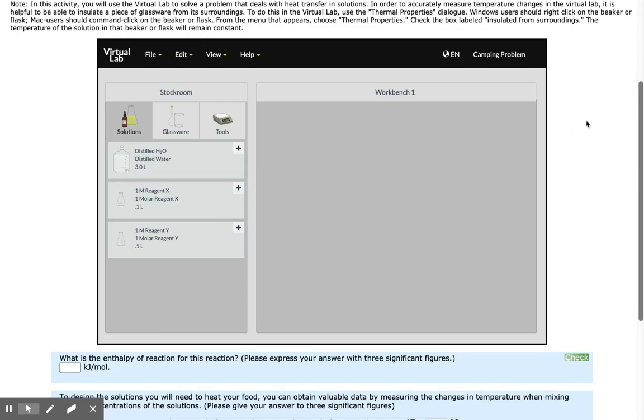Hey everyone, I'm going to show you how to use the virtual lab workbench to mix your solutions for conducting each part of this experiment.